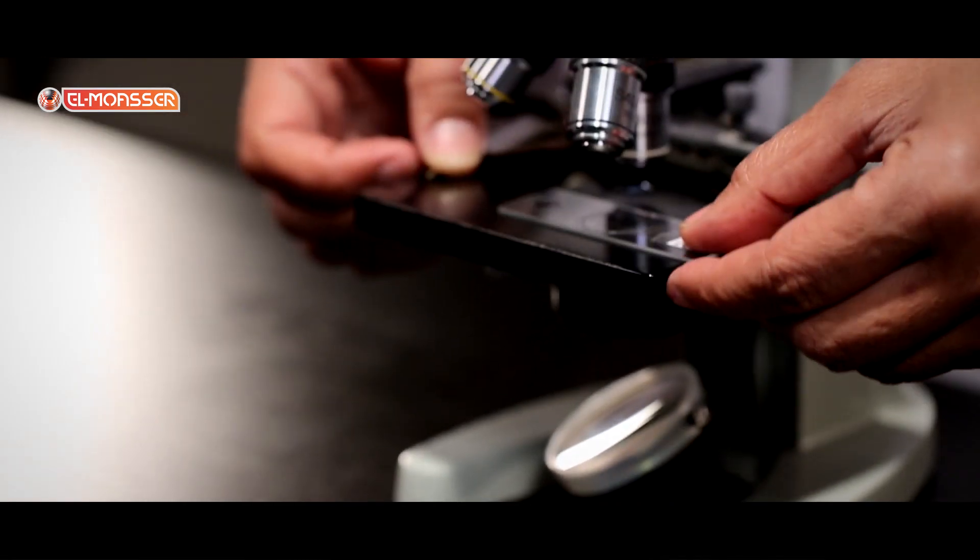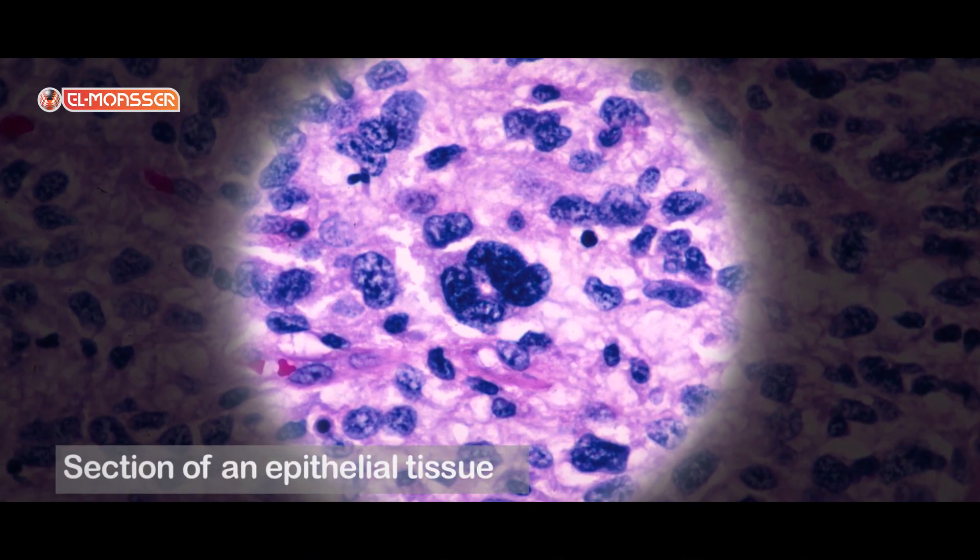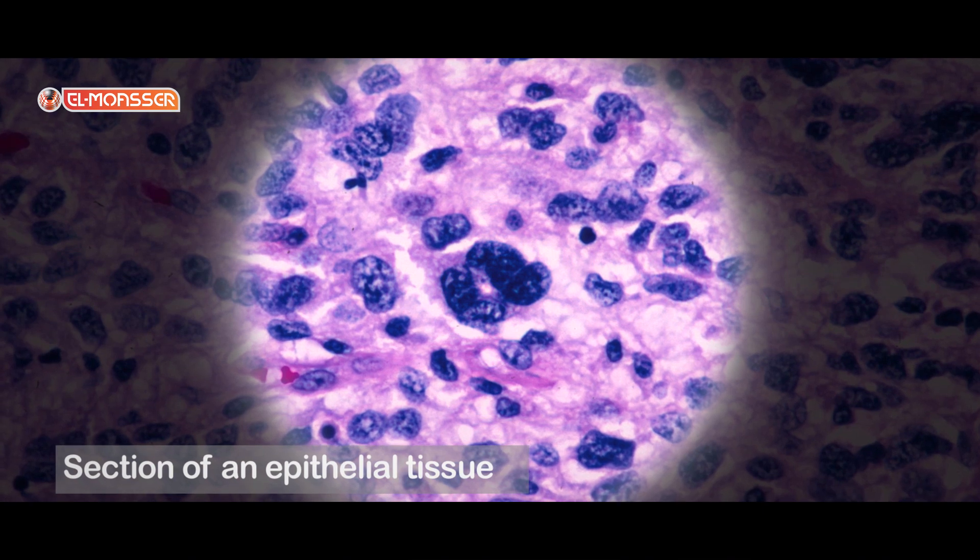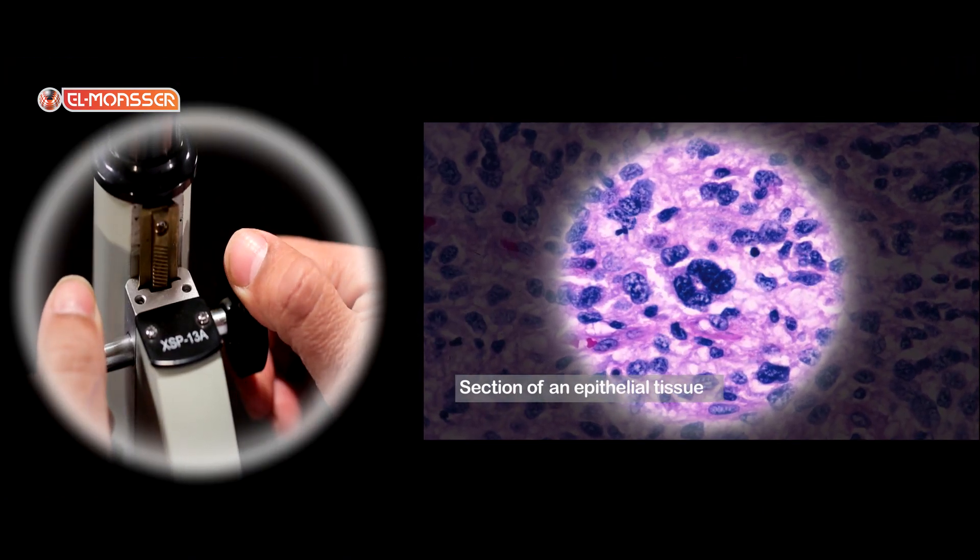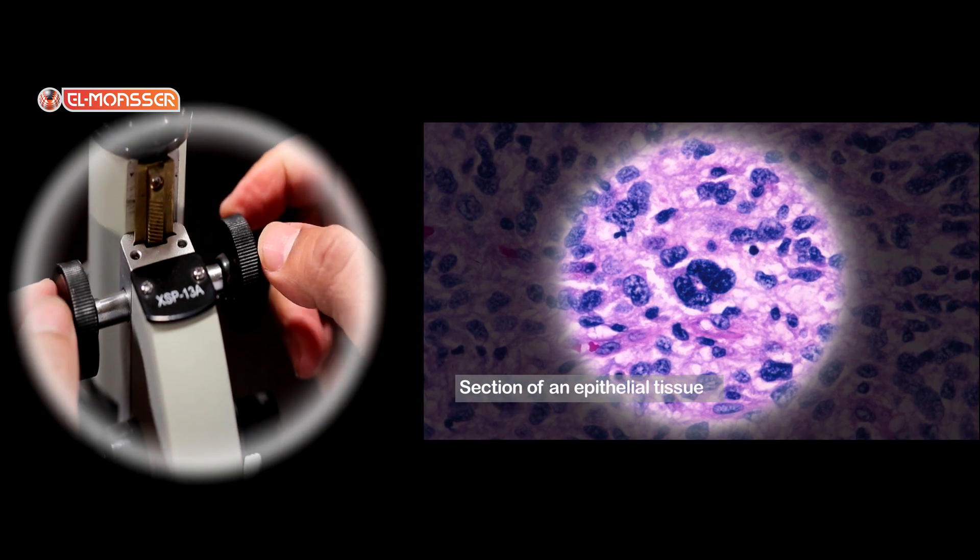Place the third slide on the stage. This is a section of an epithelial tissue. The epithelial tissue is composed of simple adjacent and identical cells.